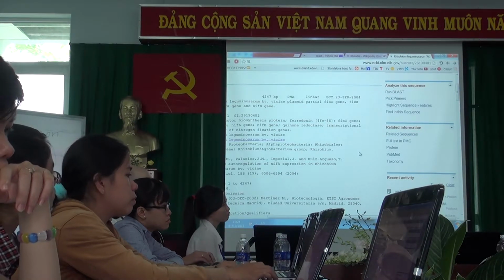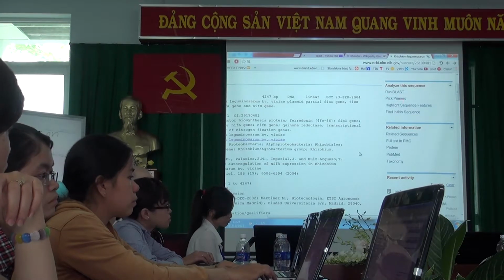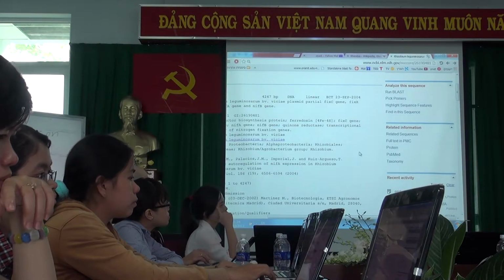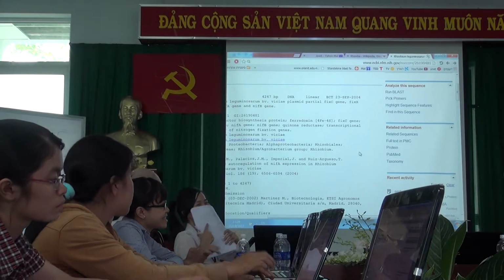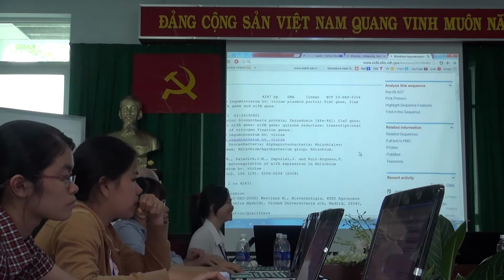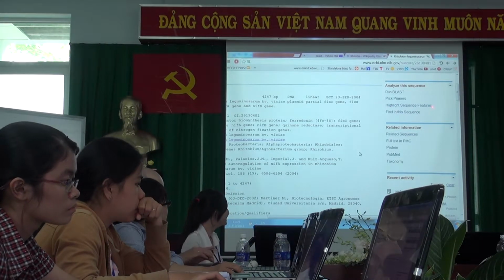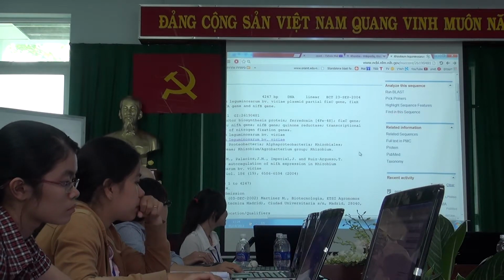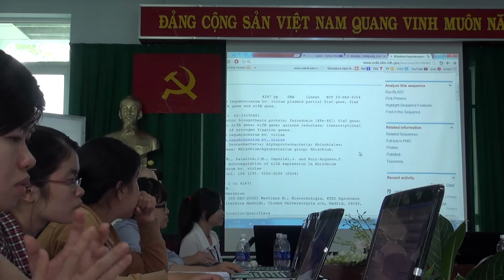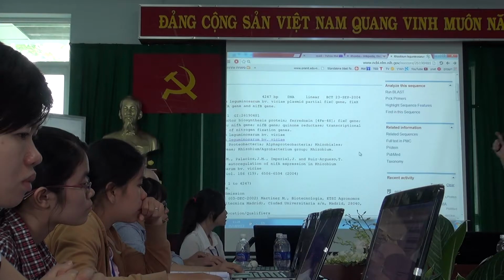next week how to do that. We can pick primers. Who here wants to know how to pick primers? We will do that also next week. We can highlight features, and we can find specific sub-sequences in this sequence.